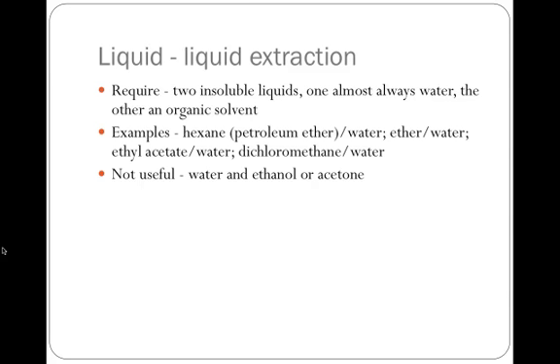Hexane could also be petroleum ether, which is a mixture of hydrocarbons, but they fulfill the same purpose. You might have partition between ether and water, ethyl acetate and water, dichloromethane and water, and many others. The important criterion is that they not be soluble in one another. So water and ethanol won't work. They mix completely. Water and acetone won't work. They mix completely. So you have to have phases that are immiscible.